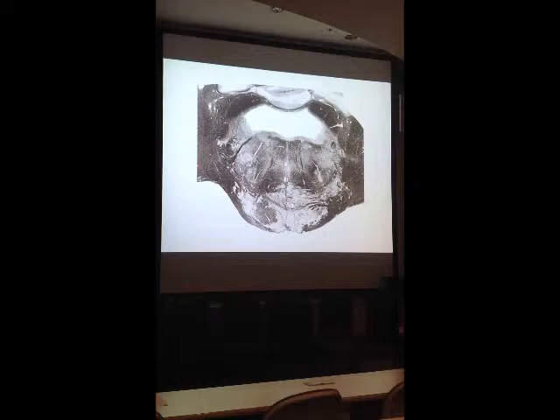Again, you see the middle cerebellar peduncle has been trimmed up. You can kind of get the idea that these pontocerebellar fibers are going into that middle cerebellar peduncle back to the cerebellum. You can see a pretty big fourth ventricle. So we're lower down in the pons than we were in the previous slide because the fourth ventricle is wider. You can see not only the middle cerebellar peduncle, you can see the superior cerebellar peduncle here and here. And you see the uppermost part, or at least part, of the inferior cerebellar peduncle. Part right here, and there's some right here, inferior cerebellar peduncle.